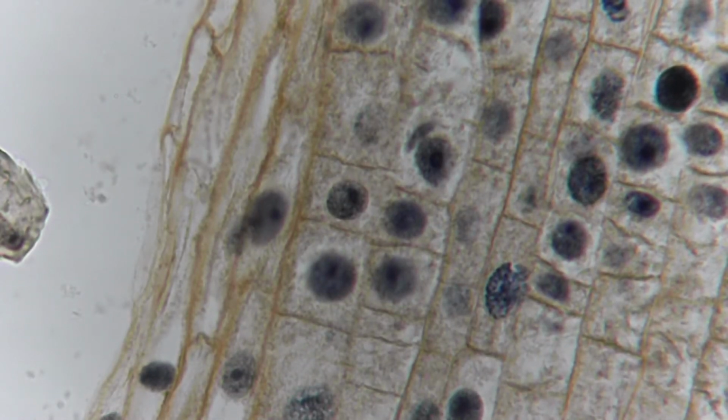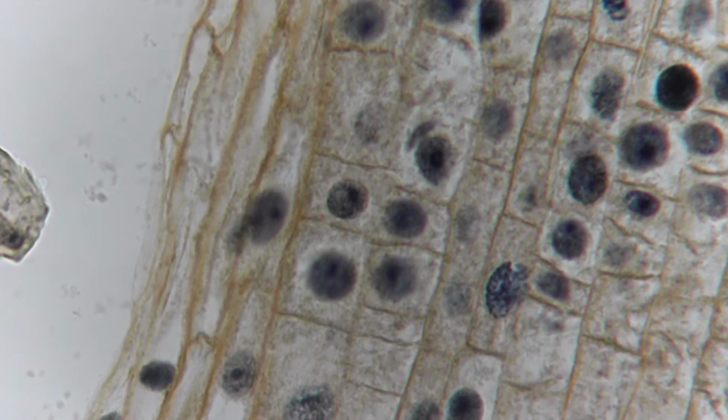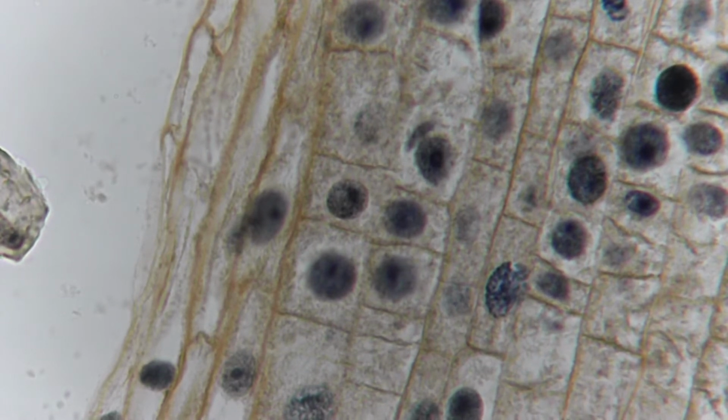This is for exercise 3B, plant cell mitosis. So you'll be setting up a drawing page and dividing it into 6 equal parts. And in another video, I'll actually be making the drawing for you. In the 6 different sections of the page, the subheadings are these 6 procedures.